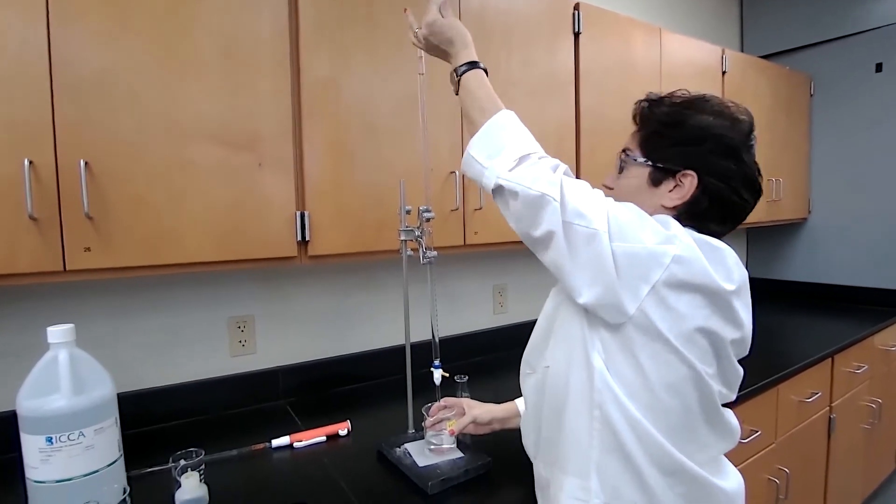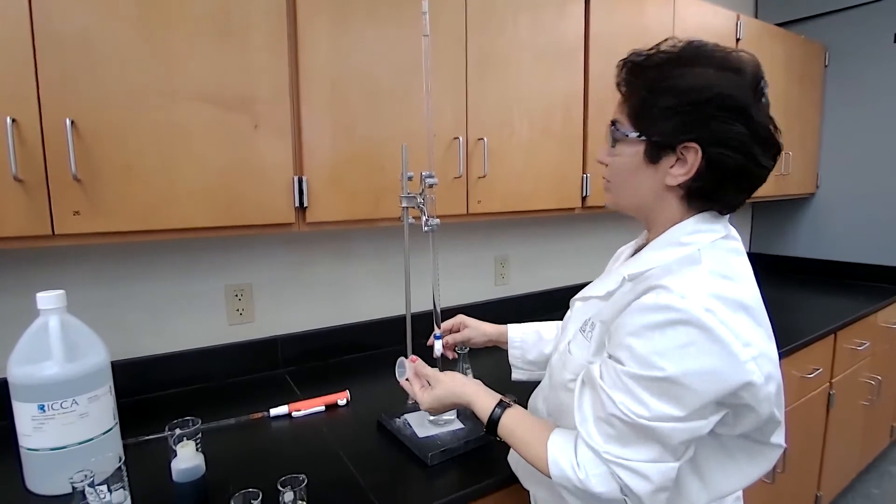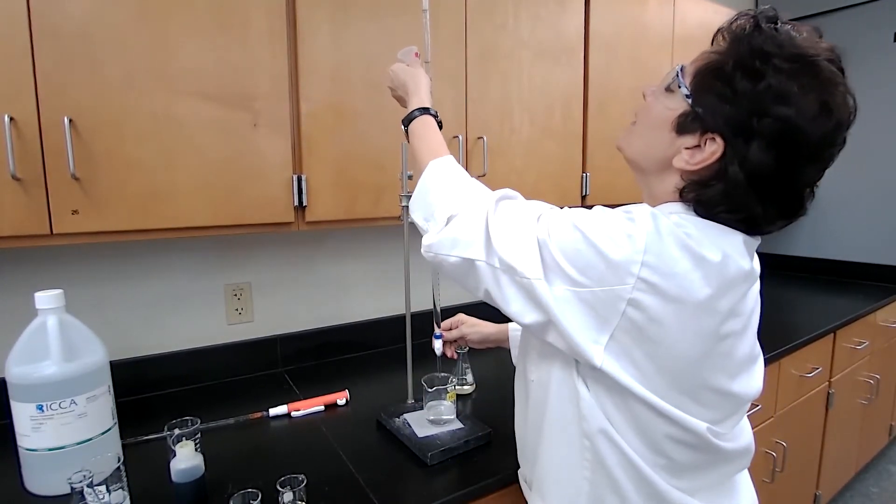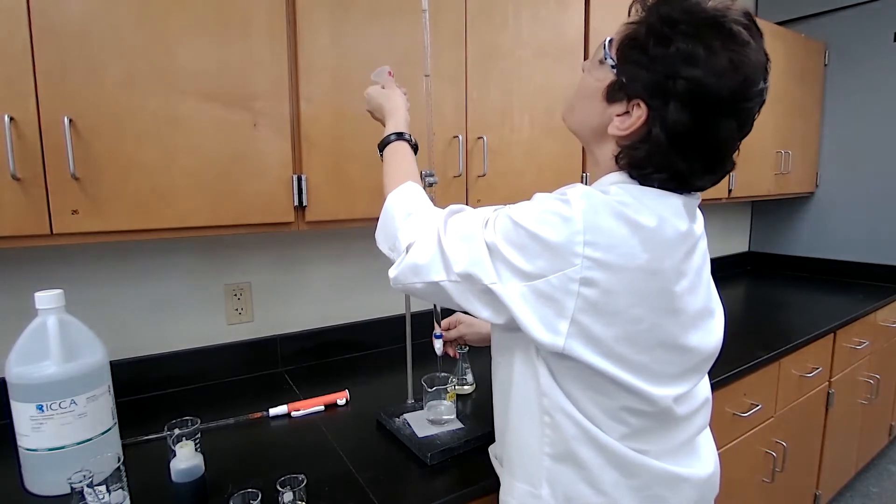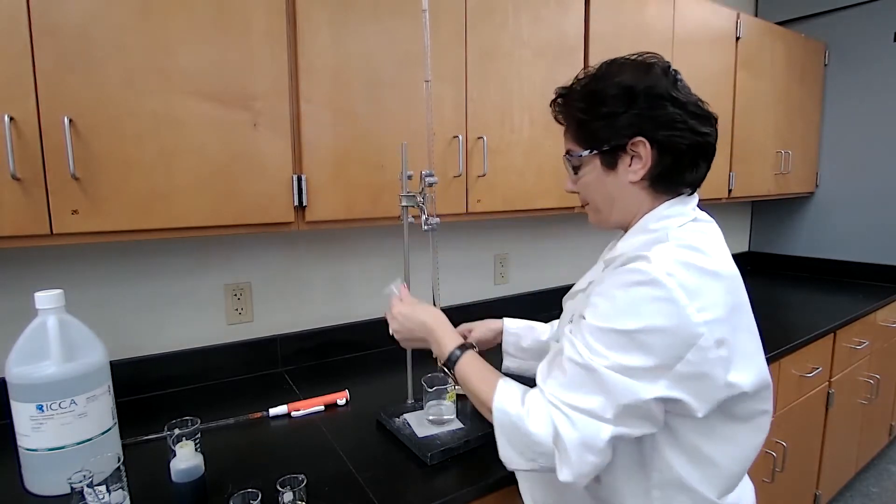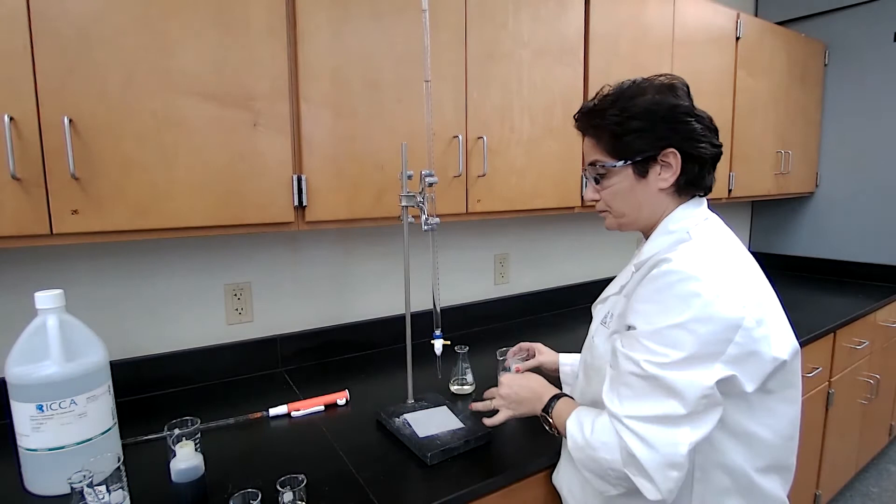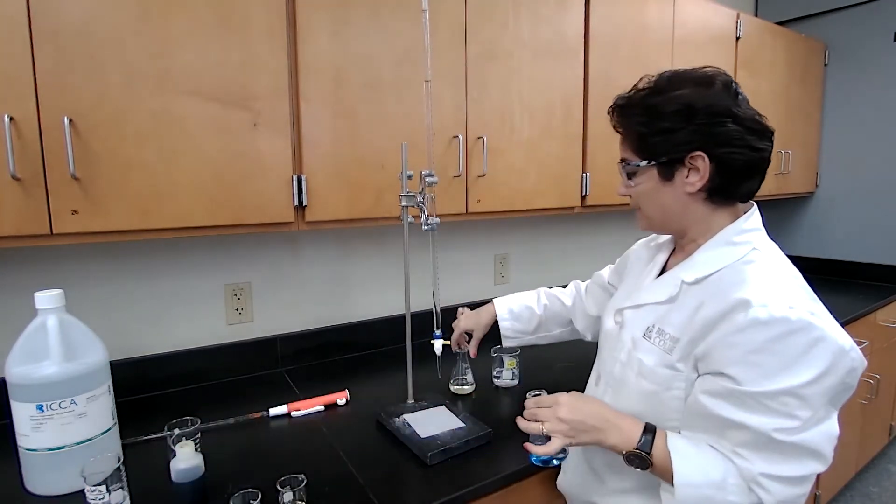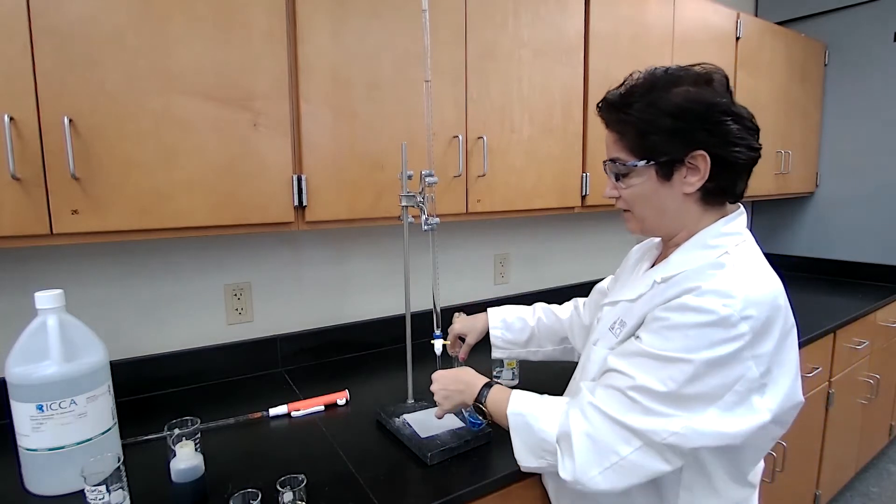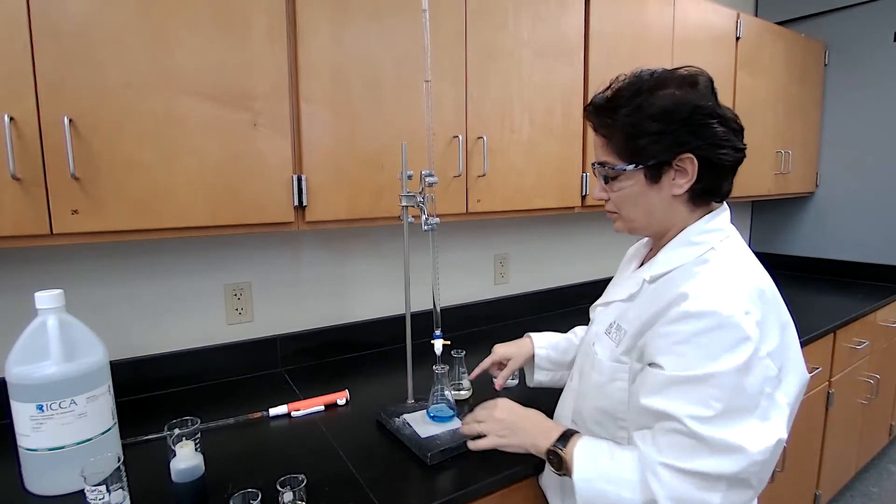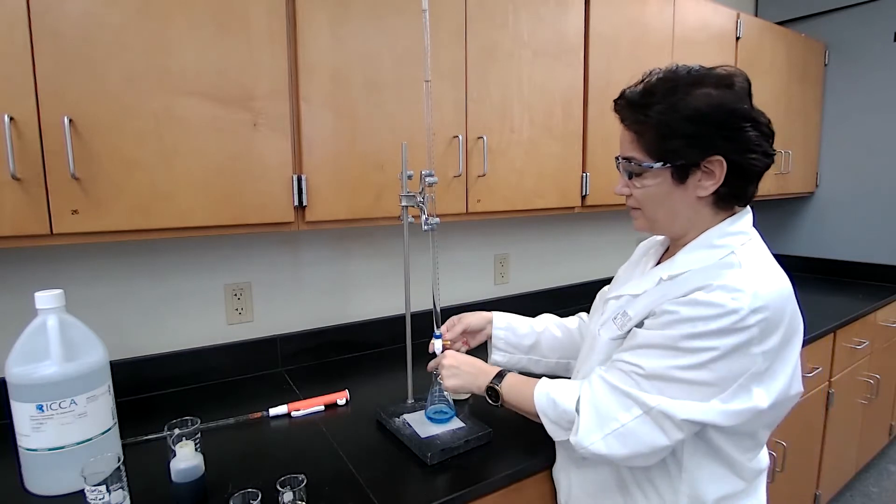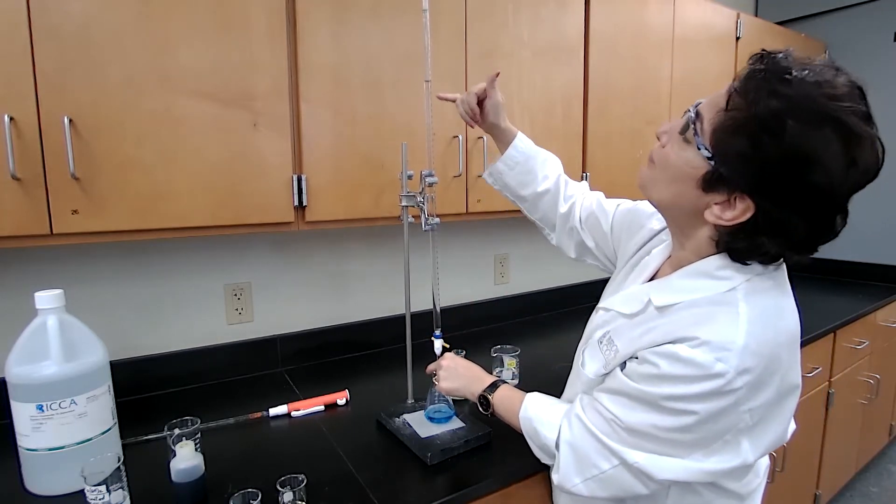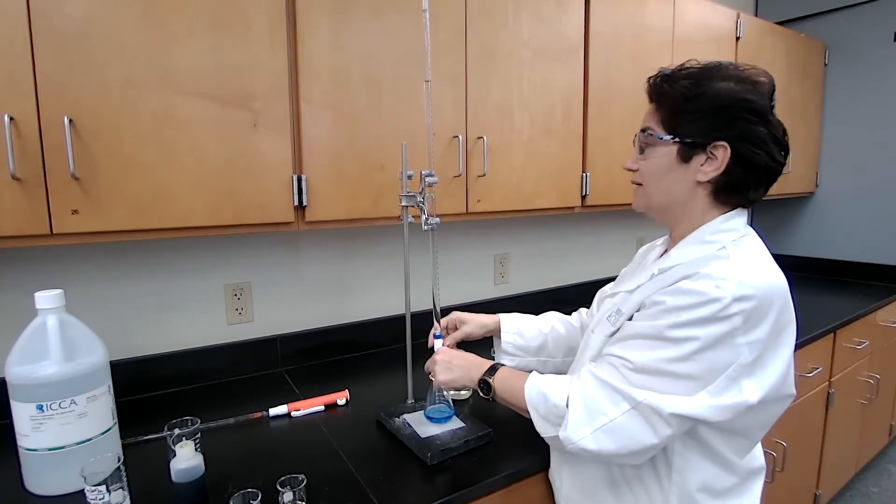This time actually, I'm going to start from different number. I'm going to start from 10. We're starting from 10. And if I add about the same amount of the acid to neutralize the base that I have, according to the first trial, I can go fast by adding 20 milliliters.